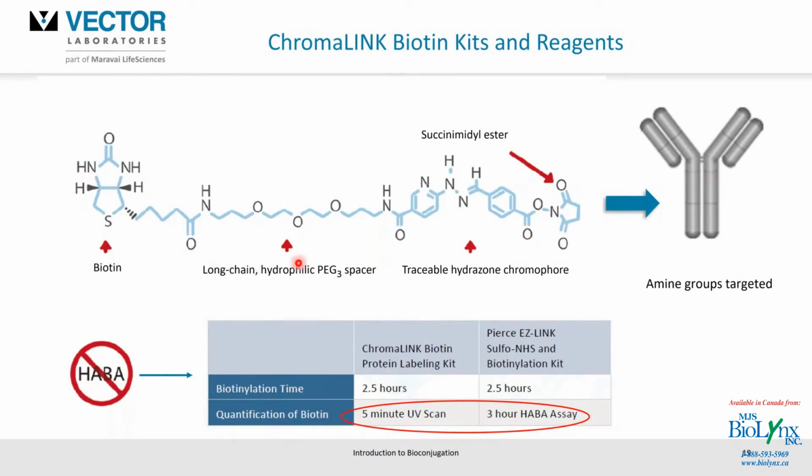What is different here, though, is there is a very long chain spacer arm. It's a hydrophilic PEG spacer arm that helps in solubility of the particular linker, and also it separates the Biotin a little further away from the antibody to prevent things such as steric hindrance, to enable this Biotin to be accessible for subsequent binding. And you will see here, as we've been mentioning about the conjugation of the HiNic and the 4FB, you do get this hydrazone chromophore being incorporated in this linker.